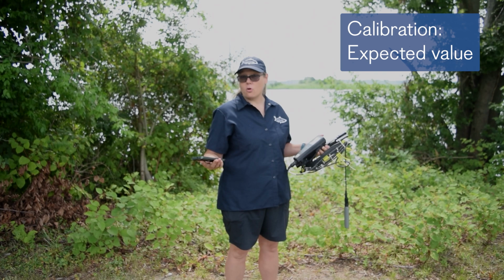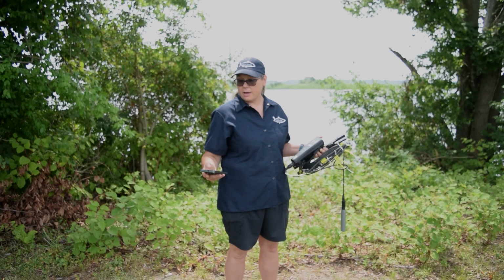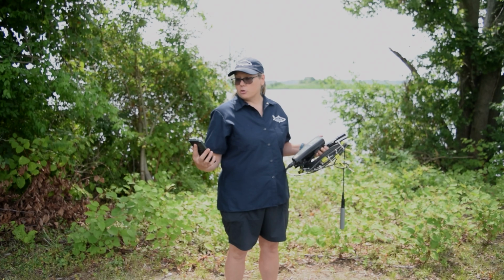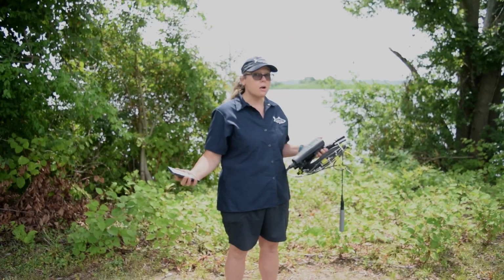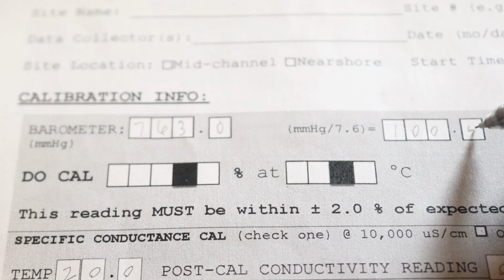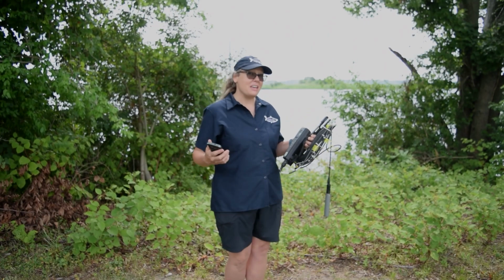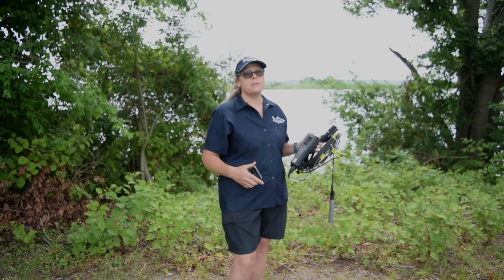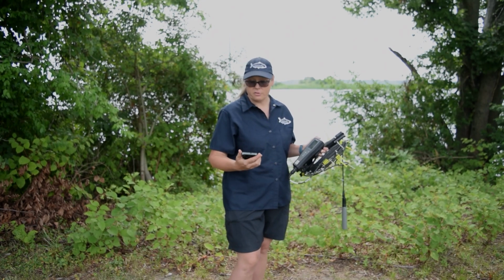Then we're going to take out our trusty smartphone and pull up our calculator app and divide 763 by 7.6. That gives us a value of 100.39. So we're going to round that up to 100.4 and record that on our data sheet where it says expected calibration value. That value is really important because when we calibrate the instrument, the DO percentage that is on the screen must be within 2, plus or minus percentage points, of our expected calibration value.